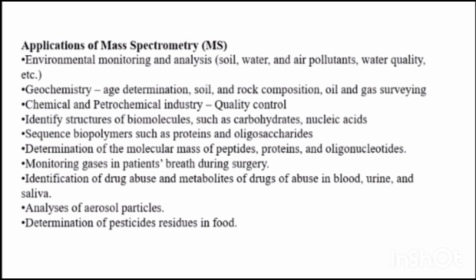It is applied in sequencing biopolymers such as proteins and oligosaccharides. Determination of molecular mass of peptides, proteins and oligonucleotides. Monitoring gases in patients' breath during surgery. Identification of drugs of abuse and metabolites of drugs of abuse in blood, urine and saliva. The analysis of aerosol particles. Determination of pesticide residues in food.